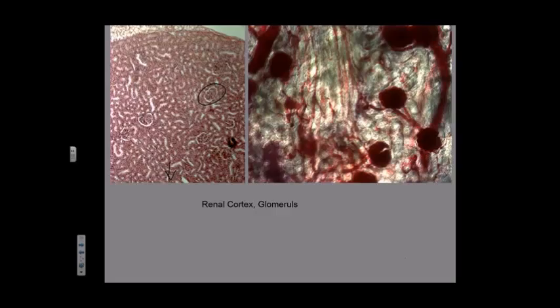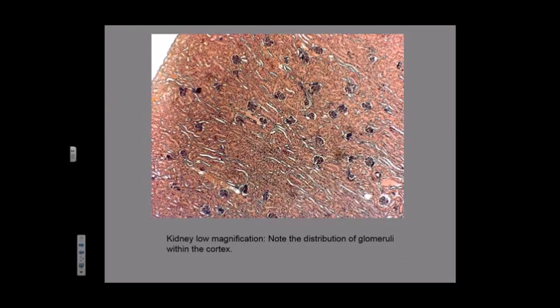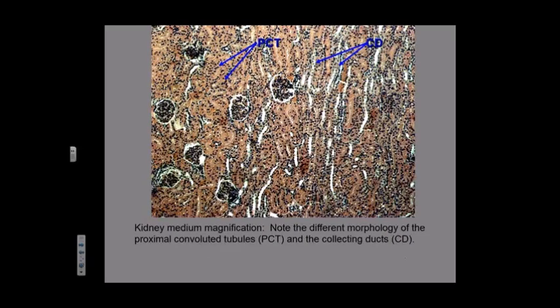So here is the cortical nephrons. The juxtamedullary nephrons are down there. Here's some more vasa recta at higher power. Here is an afferent and an efferent. Pretty cool images. Here's the cortical nephrons, juxtamedullary nephrons. This will be the loop of Henle, or where the loop of Henle is. And this is either collecting ducts or loop of Henle. Not sure. I might have to rename this.